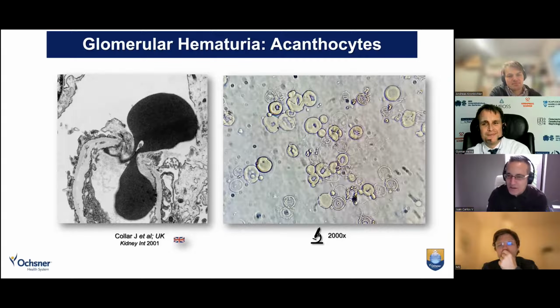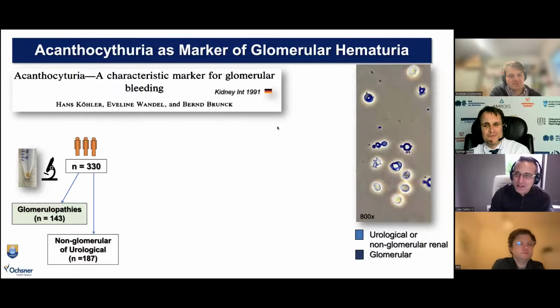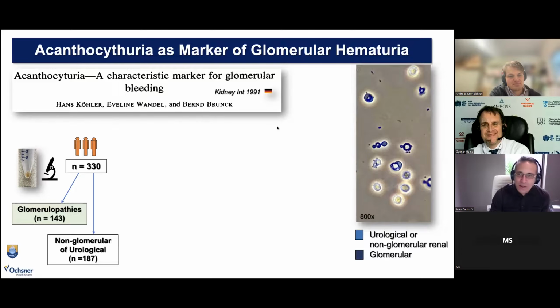in this 2000X image. And the seminal publication, once again, comes from Central Europe using phase contrast microscopy, as was mentioned earlier. This guy, in this case, was Hans Köhler, 1991.